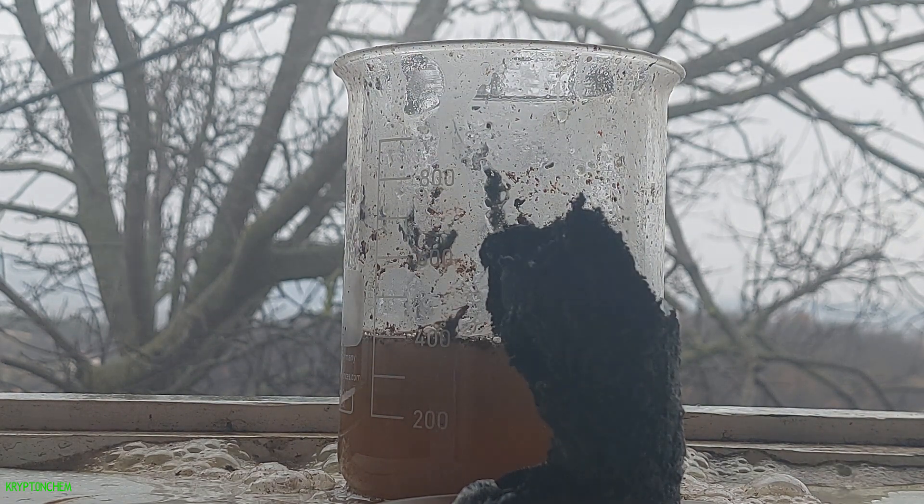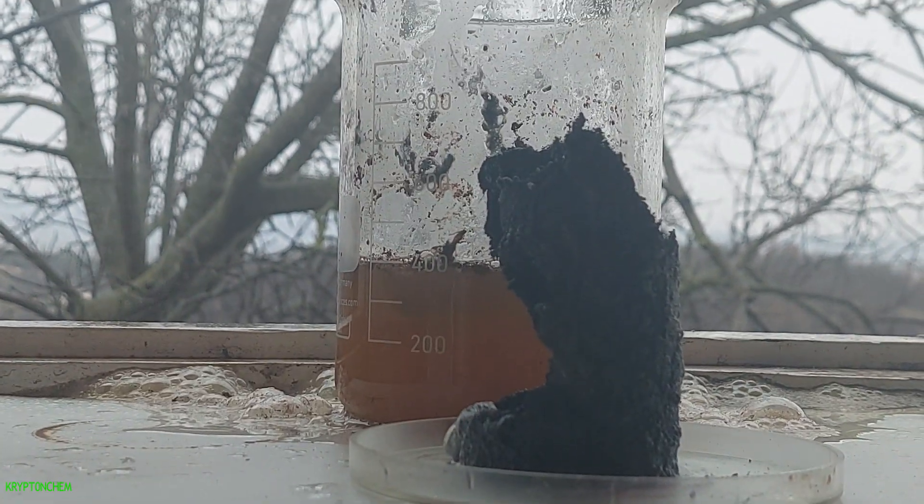Pretty scary, right? You can see what the hydrochloric acid did to this poor aluminium can.